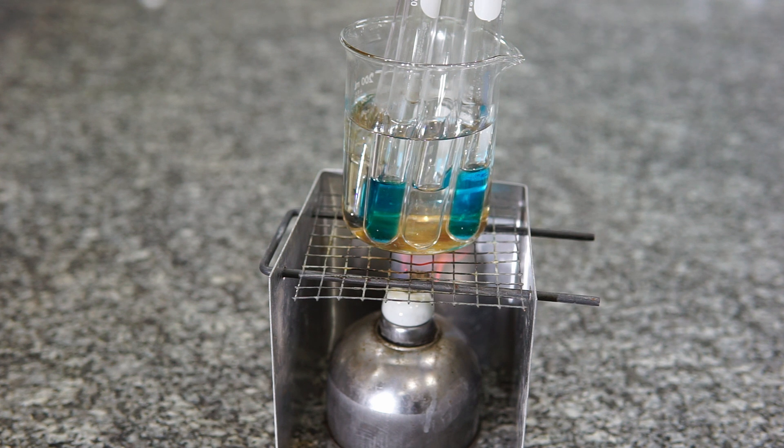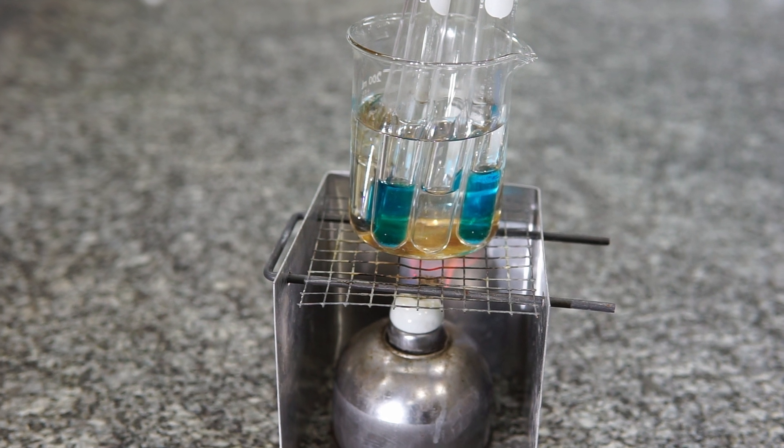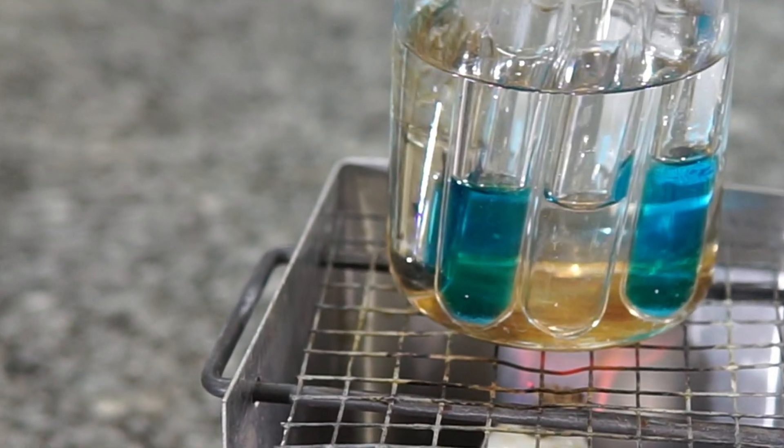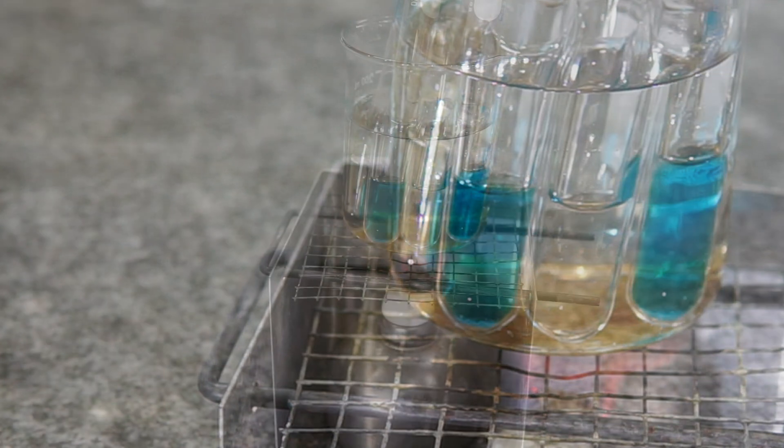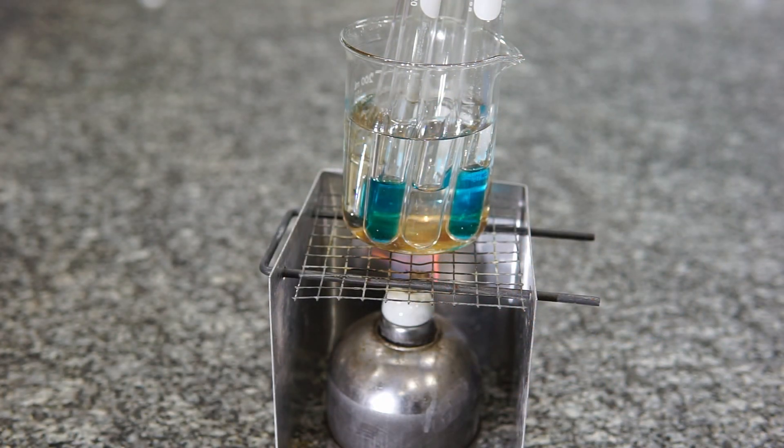So if we just zoom in here, you can actually see quite clearly we have a nice reflective silver mirror, and this is the kind of result we're looking for. That was the result we should have got if I had stopped the experiment there.